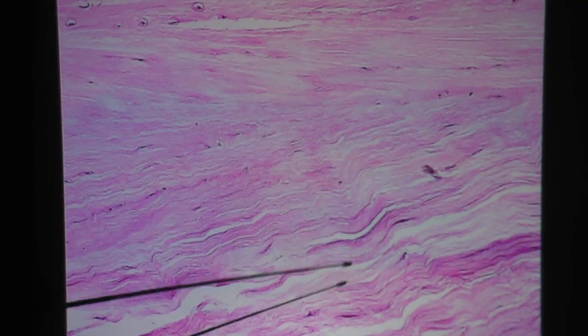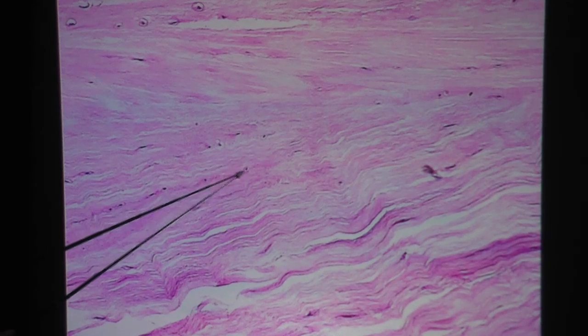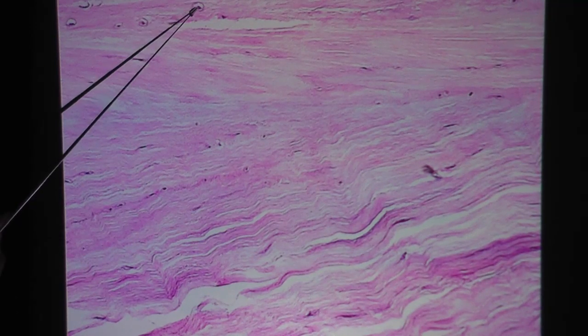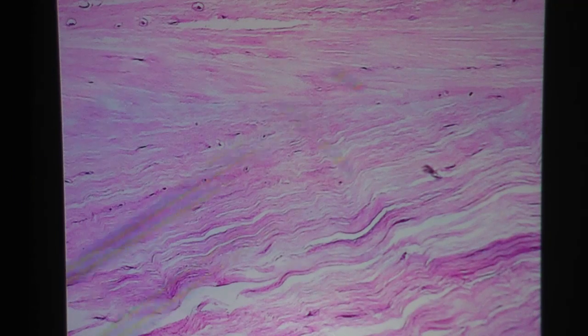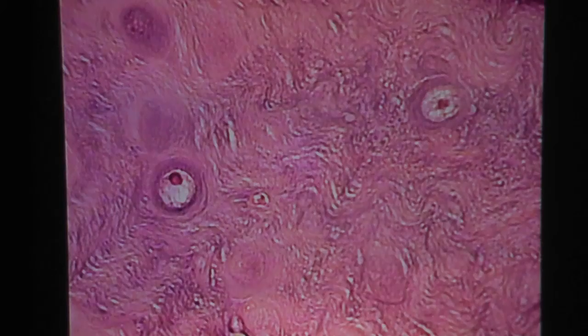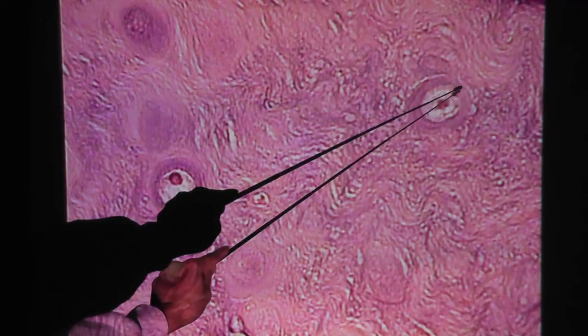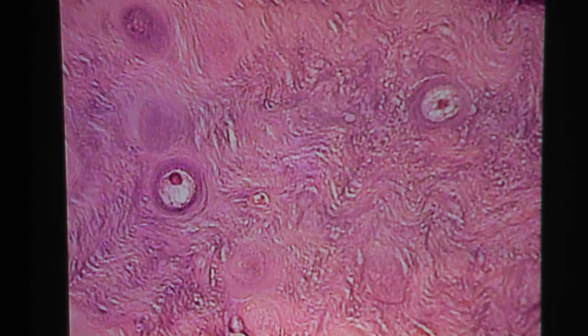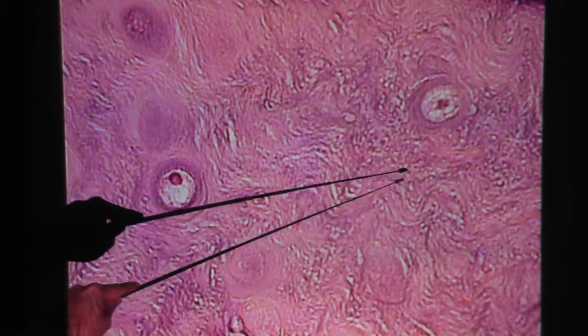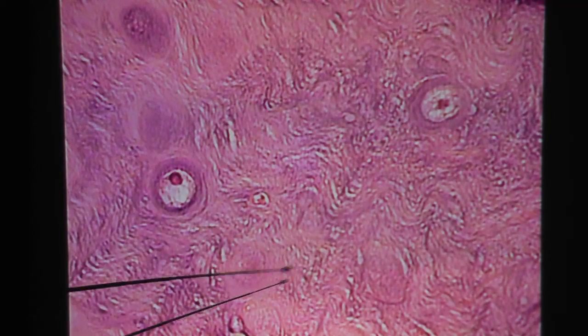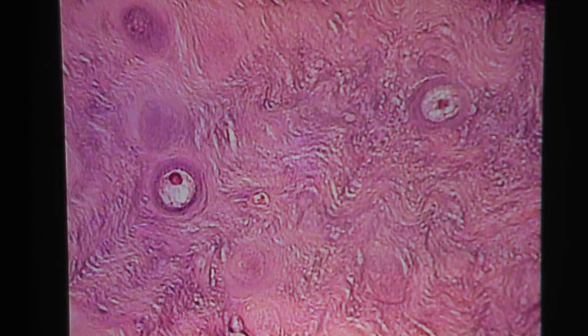Another view: the waviness of the collagen fiber. Here the cells are actually pretty small — these are chondrocytes in lacuna. Another look: here's a chondrocyte in lacuna, here's another chondrocyte in lacuna. In between is this wavy type of formation — that would be collagen fibers because this is fibrocartilage.